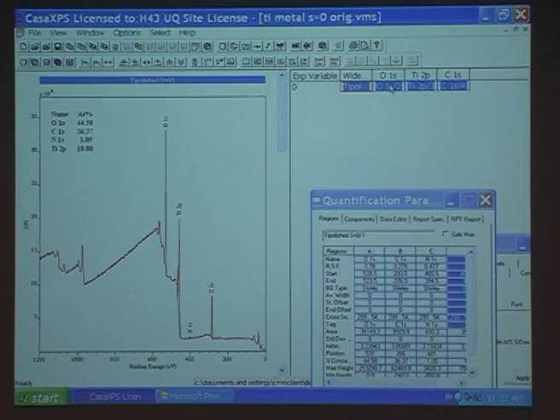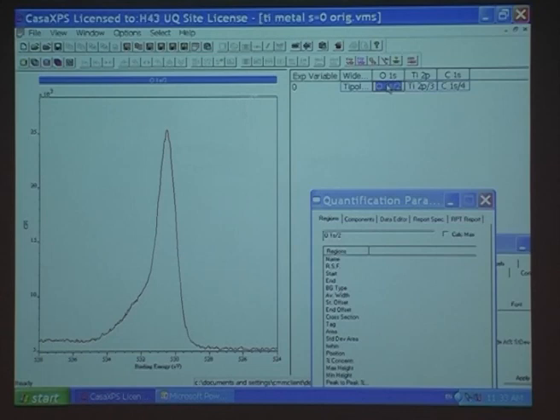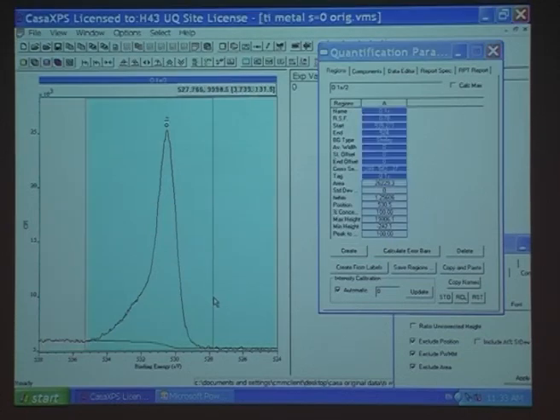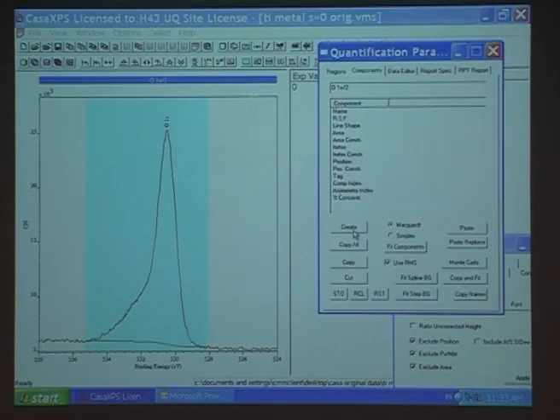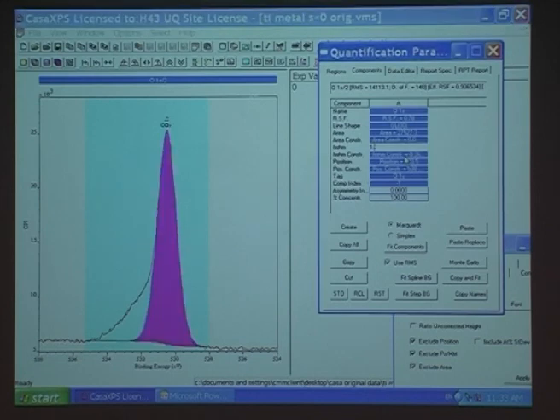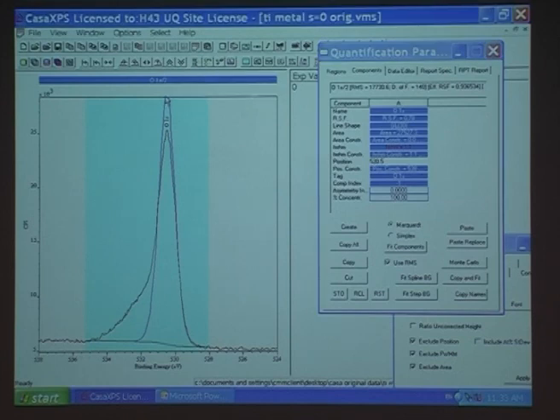Come into here. Let's do here. This oxygen looks similar, slightly different to the TiO2, because region create, we'll do this quickly, just bring this in, component create. Now this has got to be less than that, it's trying to be 1.3, I'm going to make it about 1.1, that's better. I'm going to give them a bit of freedom, 1.1, 1.3. I'll bring this one down a bit. Can't grab the top, yes I can. See, 1.1's not too bad. See, it's a nice fit, because I know there's one big peak there.